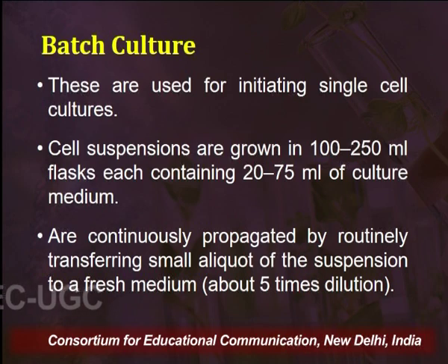Now, we will discuss the different types of suspension cultures in detail. First one is batch cultures. As the name batch indicates, in such kind of cultures, once the media is exhausted or near exhaustion, the complete culture media is replenished by fresh media.